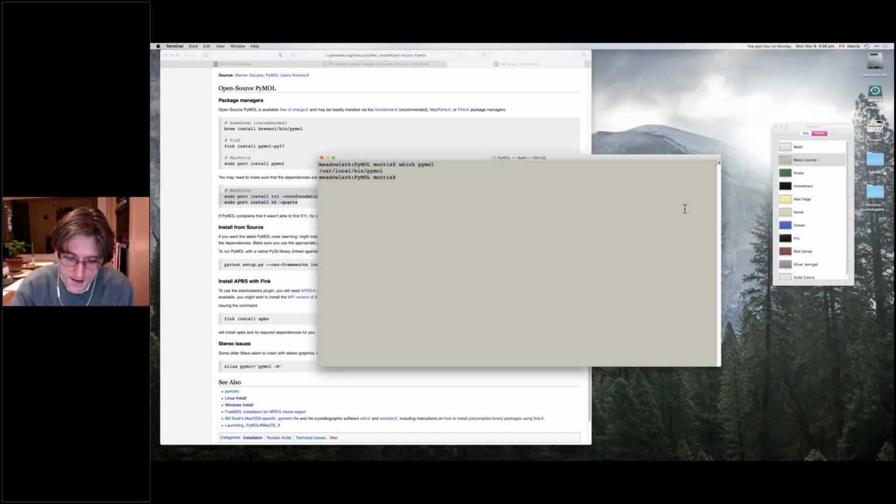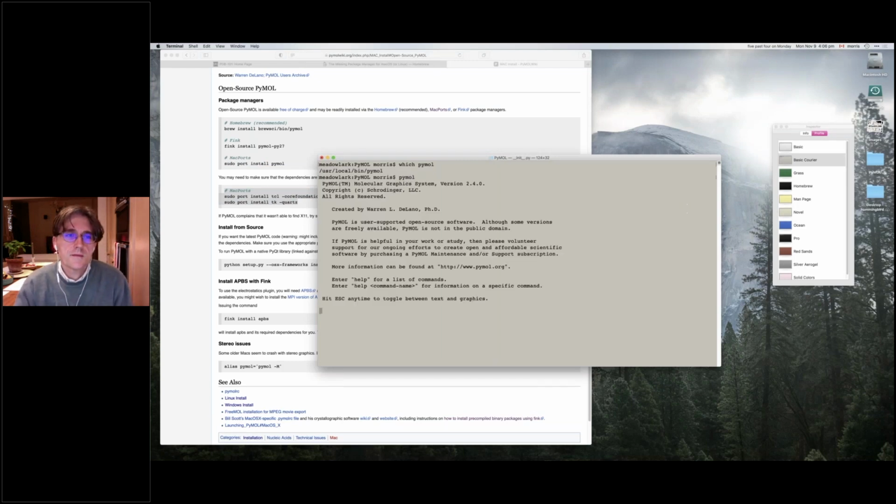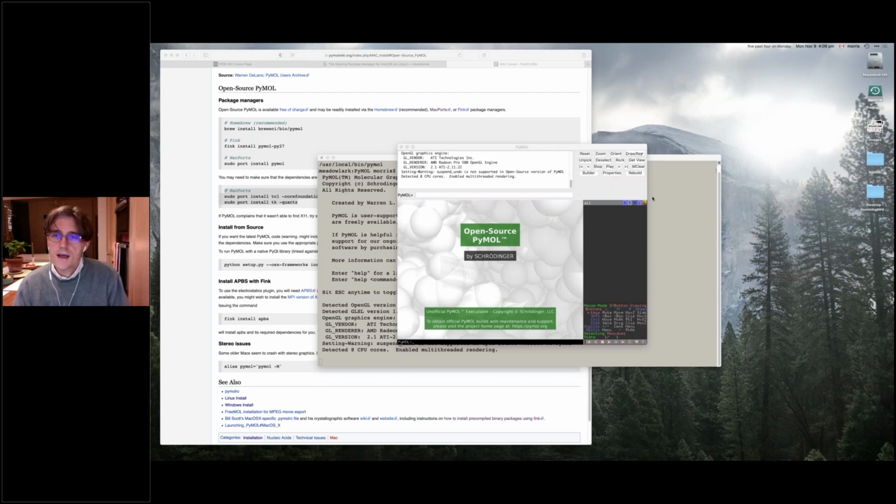Okay, so enough of that. I hope you're not afraid of the command line. We're going to be doing some typing. And this is what we get when it starts up.